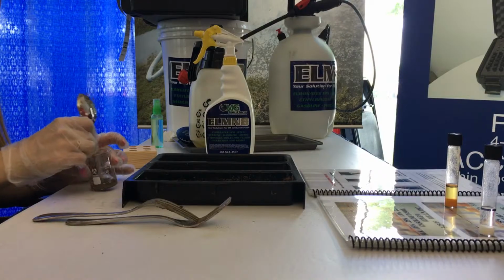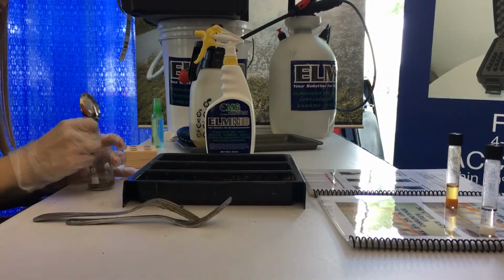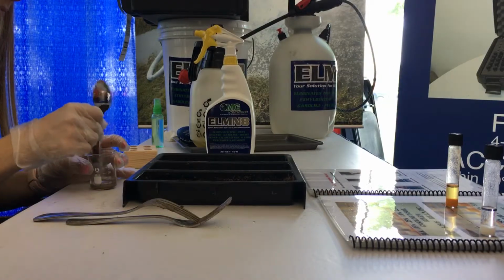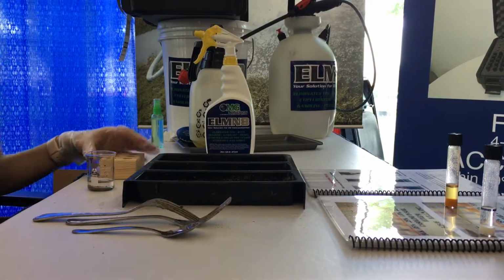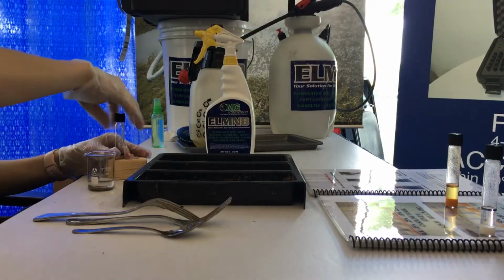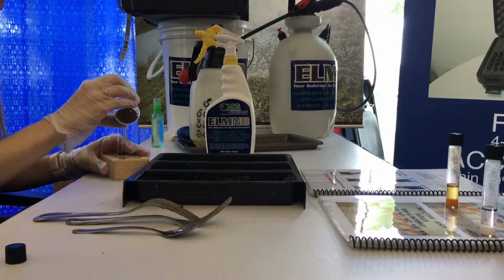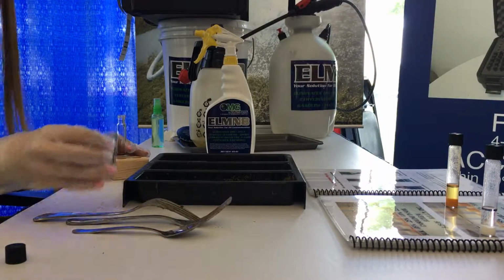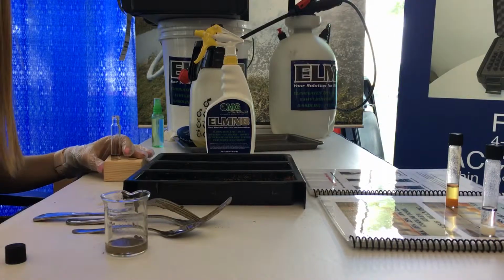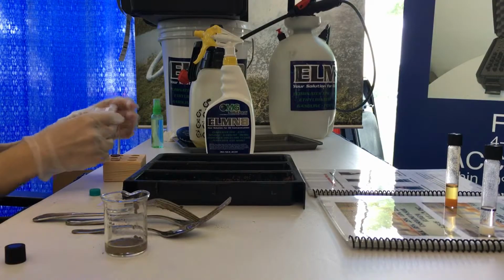I don't know if you had seen earlier the extracts over here. Give me the dirty one, the beaker. That's the dirty one. A telltale sign of high contamination is when the solvent's no longer clear. Notice how clear that solvent is right there. So that means the treatment's working. But normal process, decant that off into the test tube. Or you can smell it. Add the color development reagent catalyst.